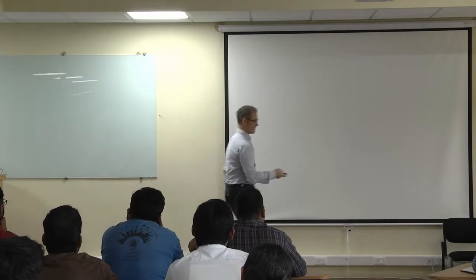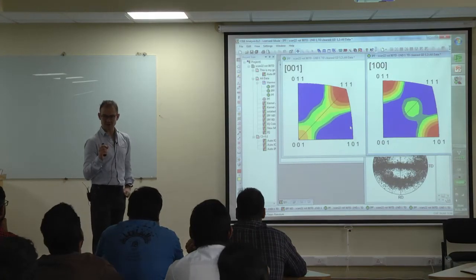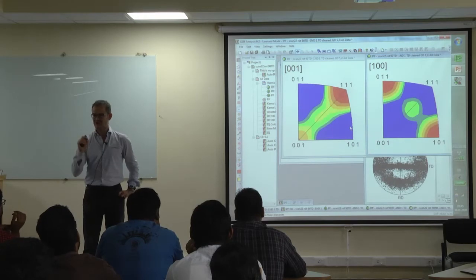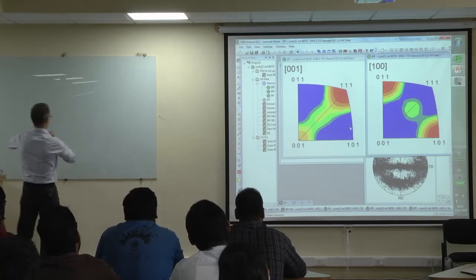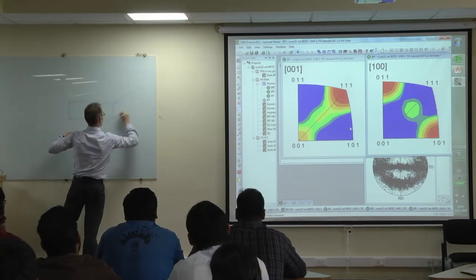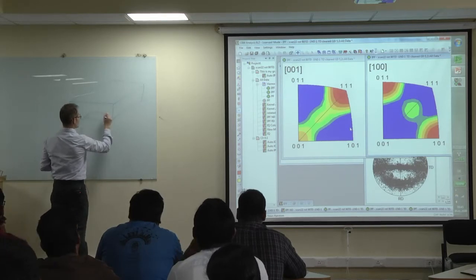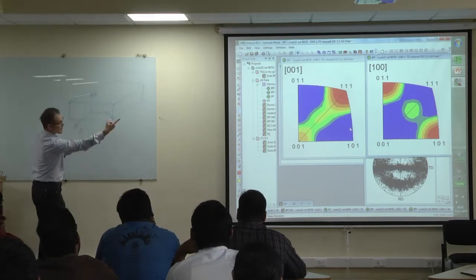I would even think that this is not the best selection, what they write there. I don't know what kind of bracket we should select, but this 001 is not a crystallographic direction. It's a sample coordinate direction. And that means, I start plotting for you again our most simple rolled material. So we have our x direction, our y direction, and z.